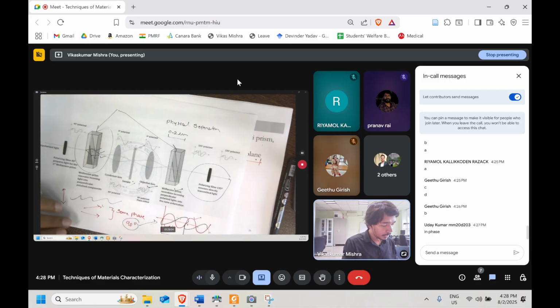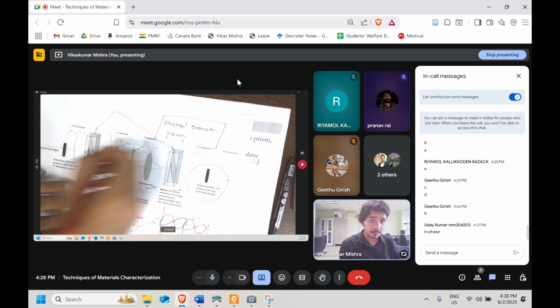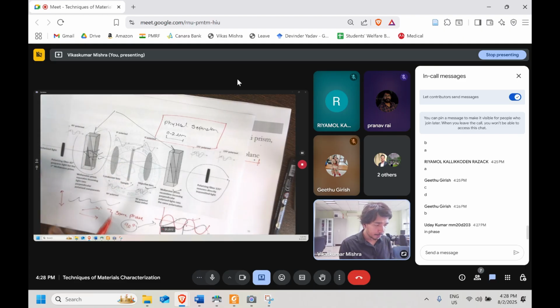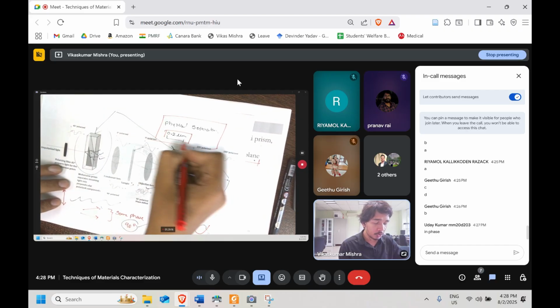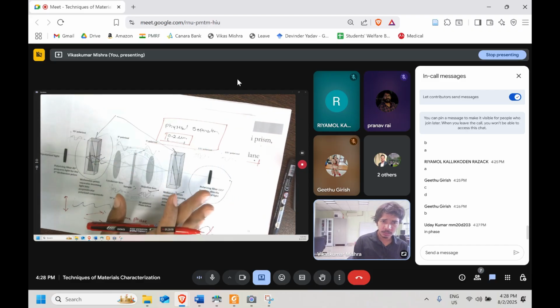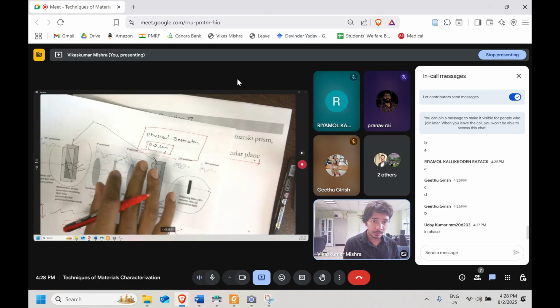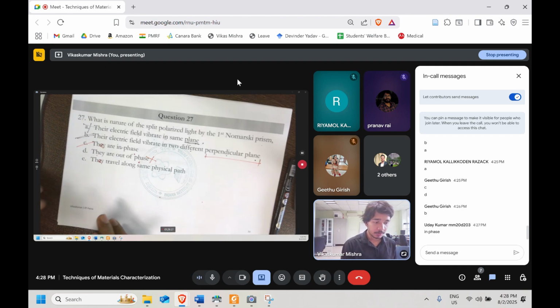We have studied that they will be physically separated. Once the condenser lens condenses them onto the specimen, they will be separated by the 0.2 micrometer difference, more or less. This is what is known as the resolution of the optical microscope on an average, right? So we separate them by that amount. So there is a physical separation in this particular way.